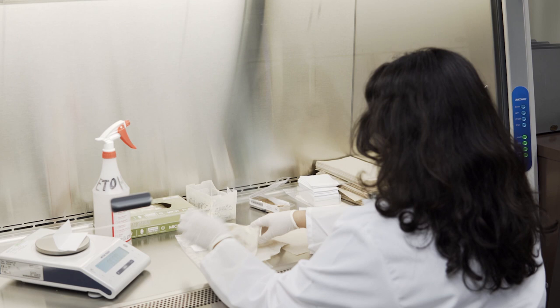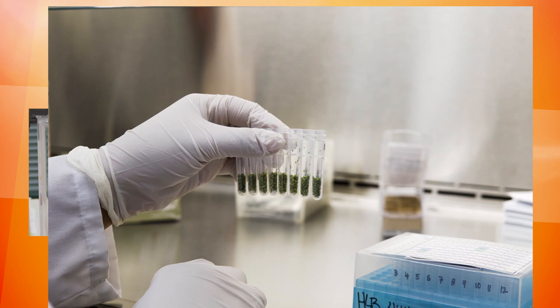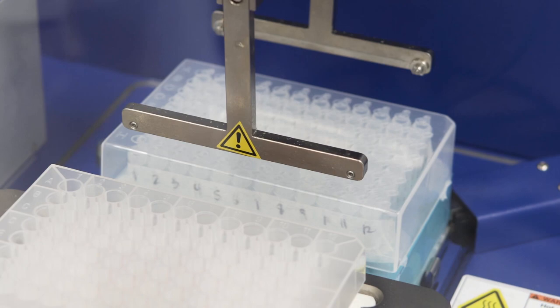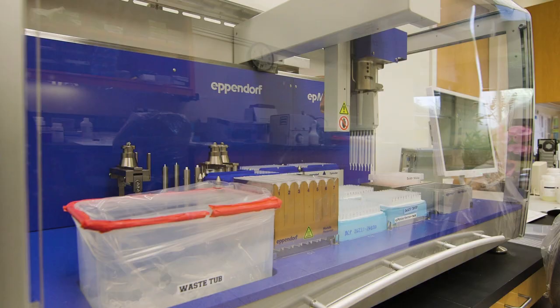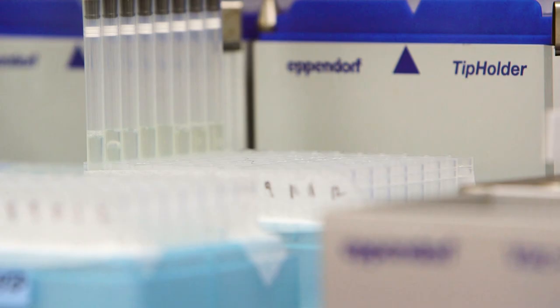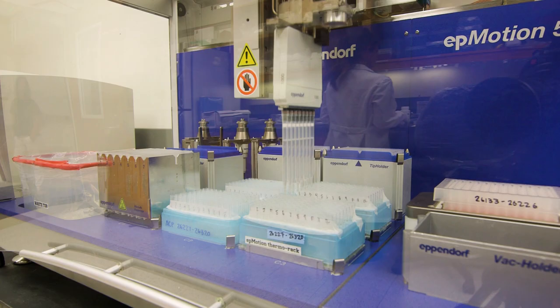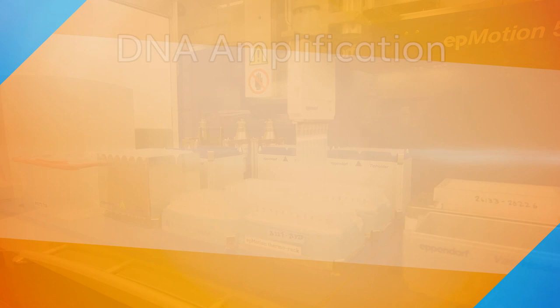Next, the plant samples are sent to the DNA extraction room. A small, dense bead is placed in every sample tube to help crush the materials into even tinier particles. Samples are then placed in the robotic liquid handler, which heats up the samples and separates unwanted materials from the DNA associated with the sample. The samples are now ready to be moved to the molecular biology room.